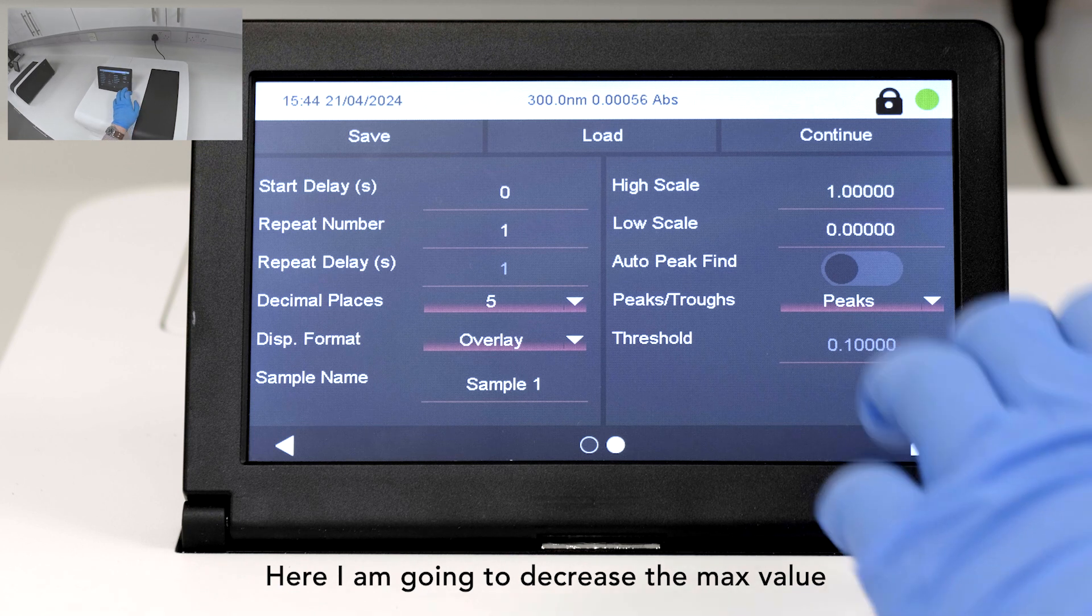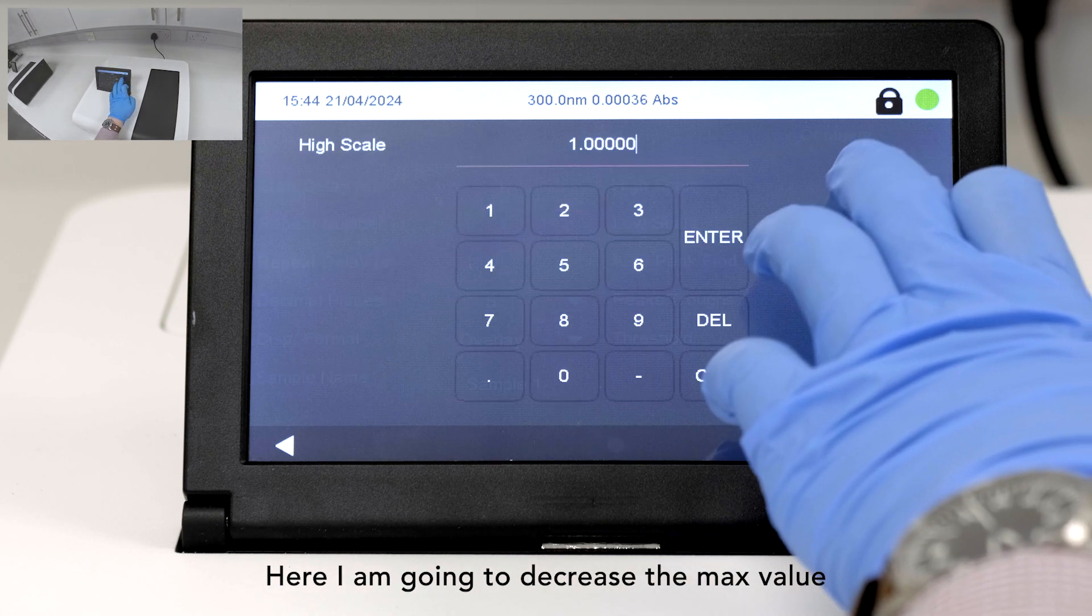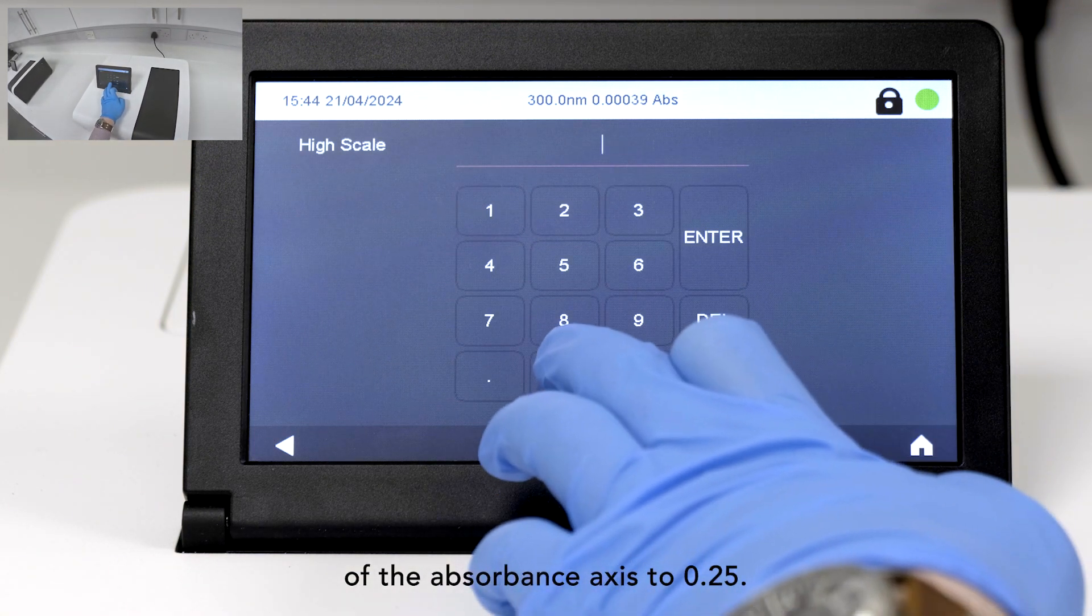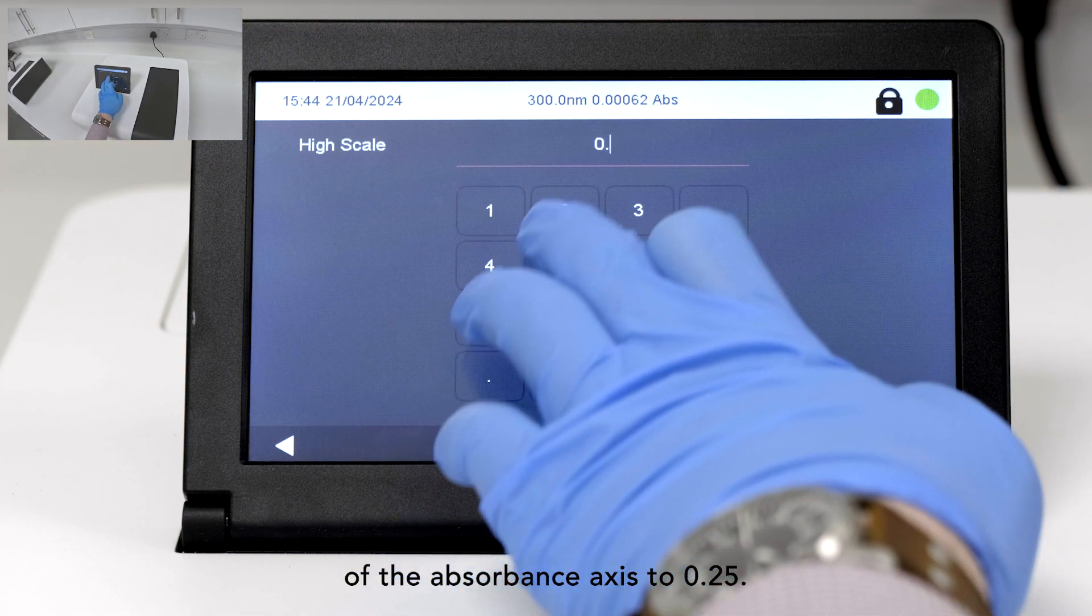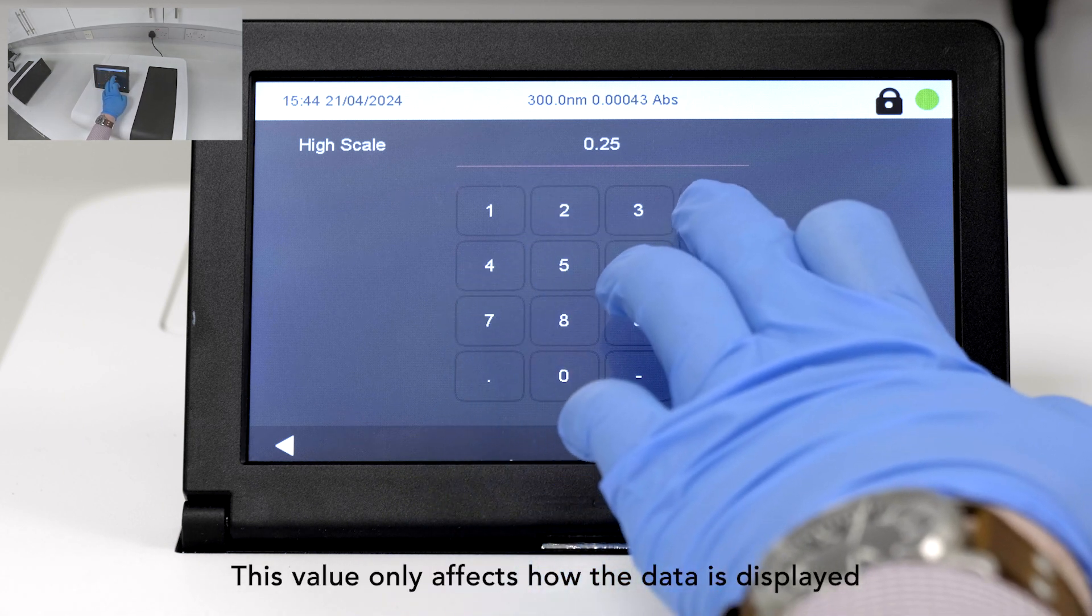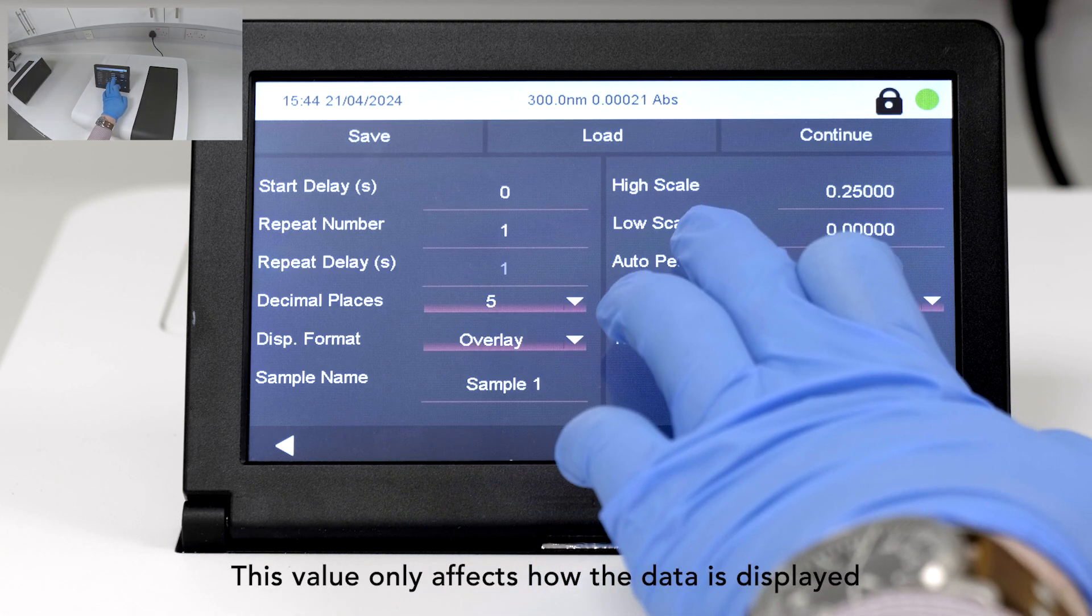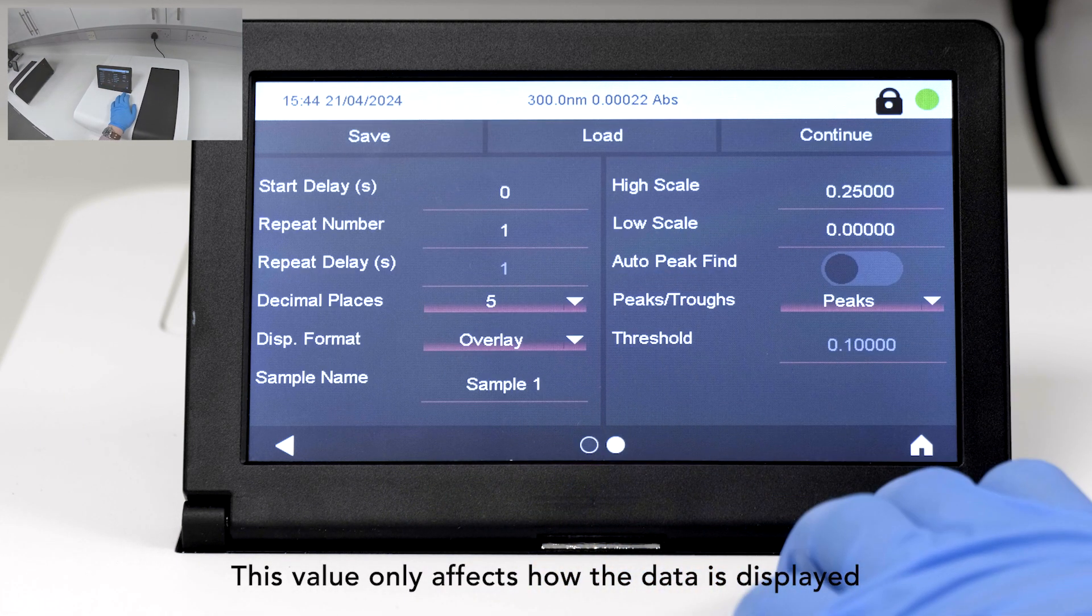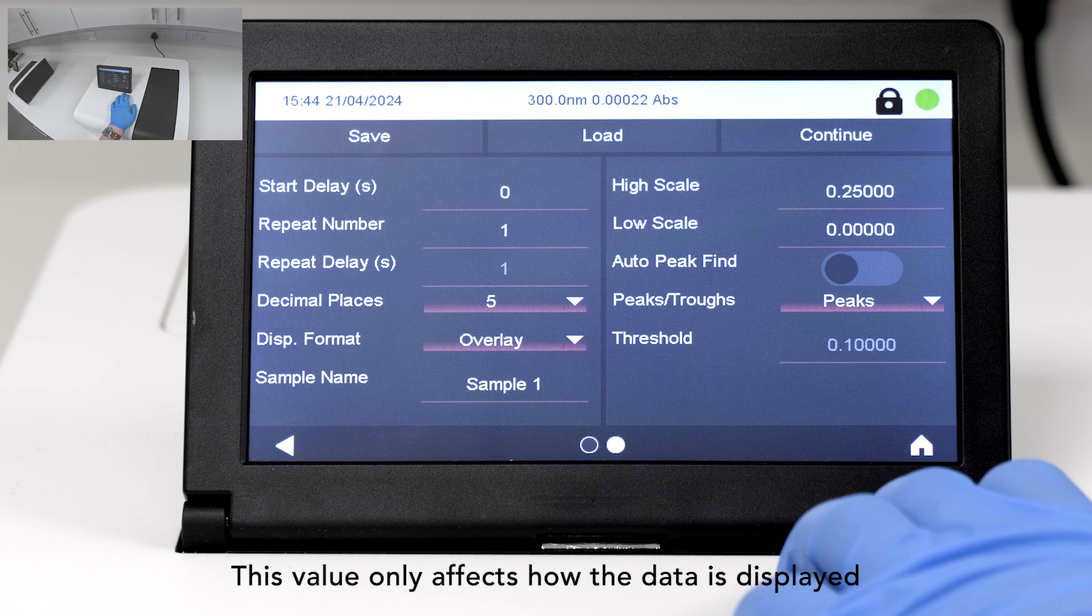Here, I'm going to decrease the max value of the absorbance axis to 0.25. This value only affects how the data is displayed and can be changed after the scan is complete.